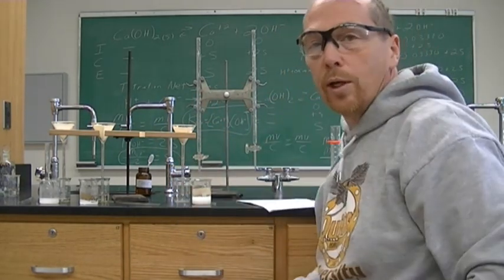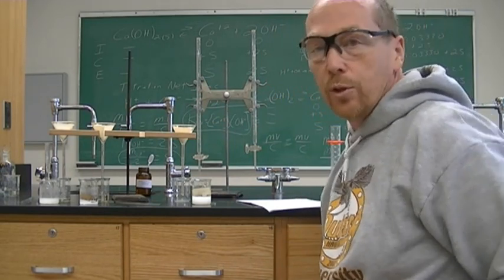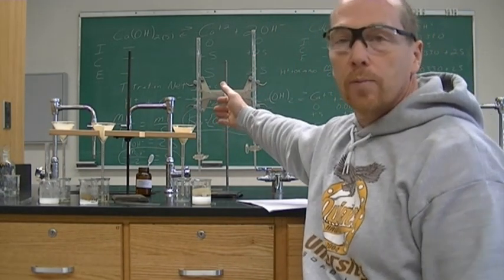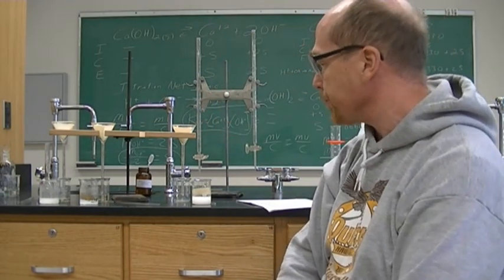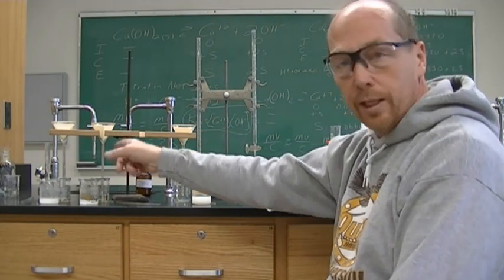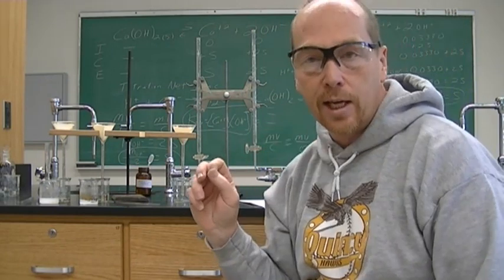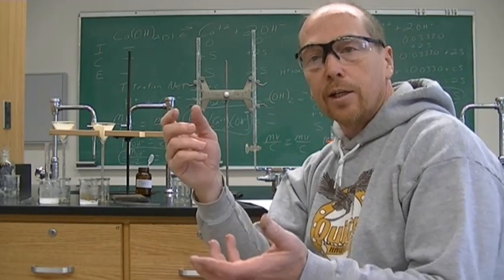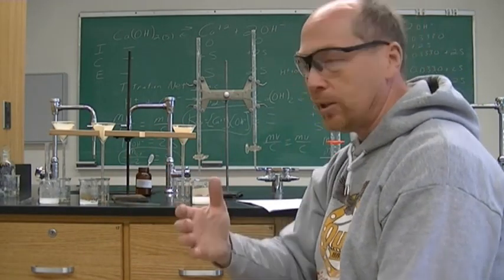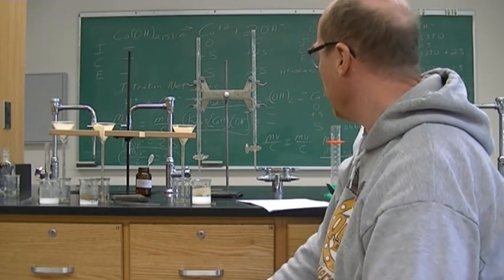All right, and so now we're going to titrate this to get our concentration of OH minus. So to titrate it, we have our HCl from experiment 12. So we're going to use our HCl from experiment 12. The base that we're going to use is each one of these solutions. The directions say to add 10 mils of calcium hydroxide. And when you do that, you get a pink solution. Then you add your HCl until that pink solution is a clear and colorless solution.